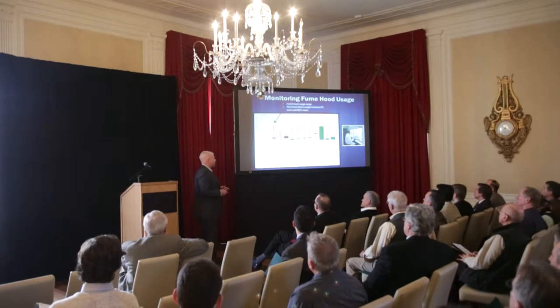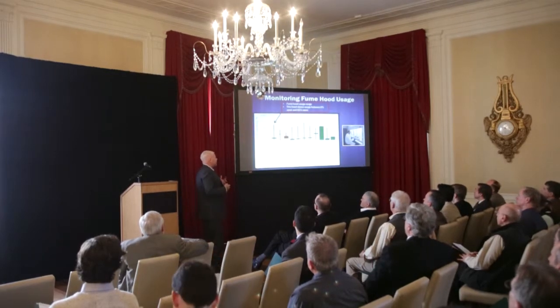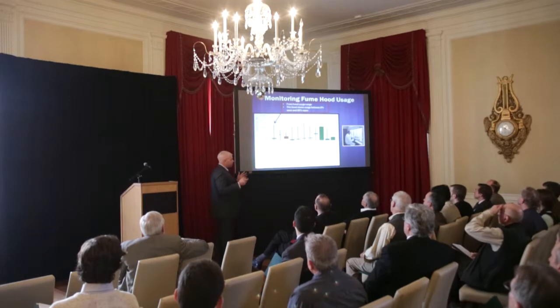But you basically are saying, let's make sure that we're staying constantly commissioned by writing work orders based on the information that I'm getting out of my dashboards. As far as the fume hoods, again, being able to run reports that give you data that you can pull and send out and say, how well am I doing?